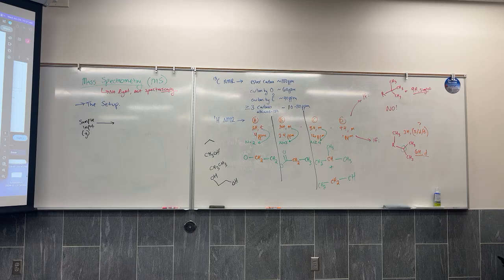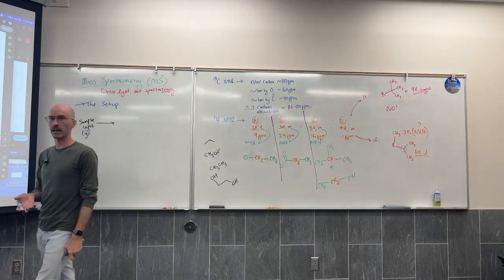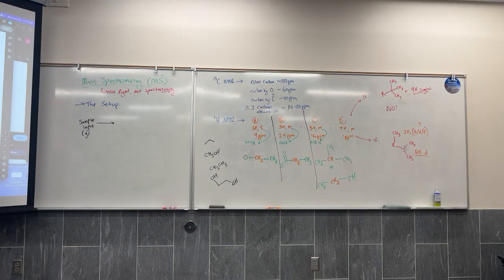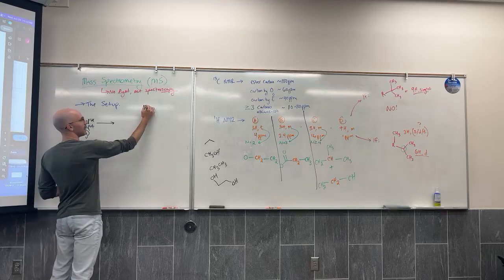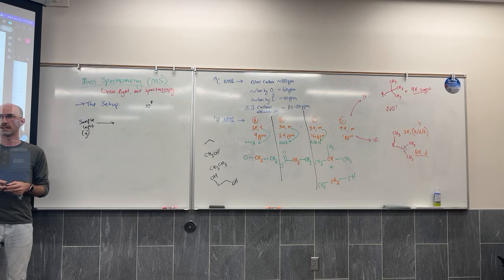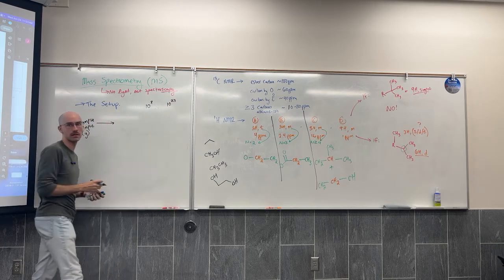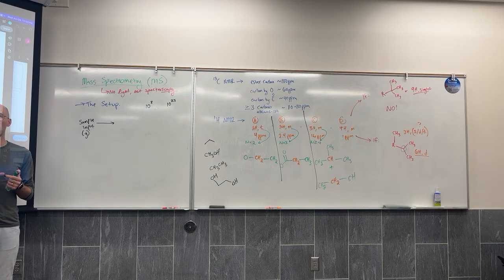And it's a very, very small amount of sample, like hundreds of millions of molecules. Just a tiny collection. I'm always trying to evoke more of a reaction, but nobody ever seems to care when I say that hundreds of millions is a small sample. Because what is hundreds of millions? It's like 10 to the 8th, right? And compare that to 1 mole, 10 to the 23rd. That is a small selection.